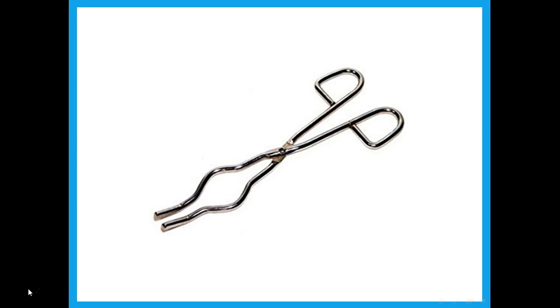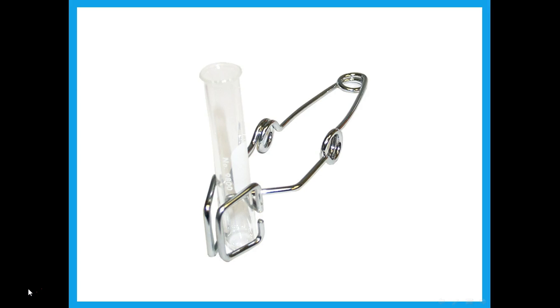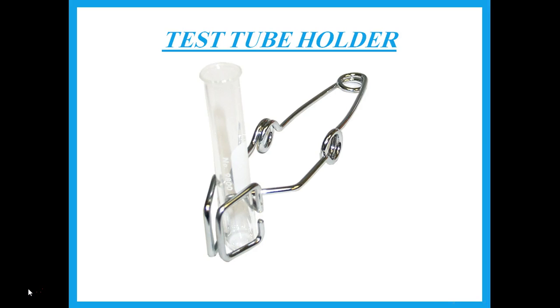This is used to hold something that's hot. This is called tongs. Okay, so we use it to hold a hot beaker, a hot crucible. This one is used to hold the hot test tube. So this is a test tube holder.